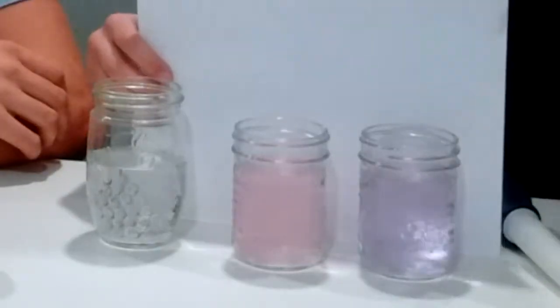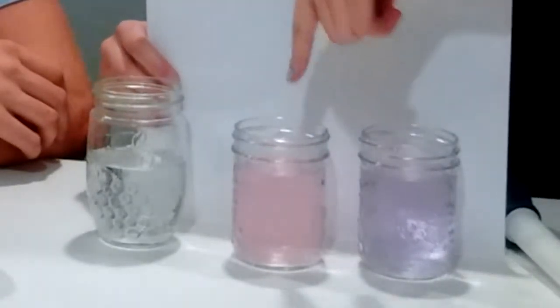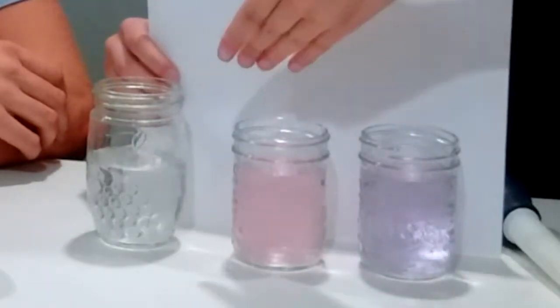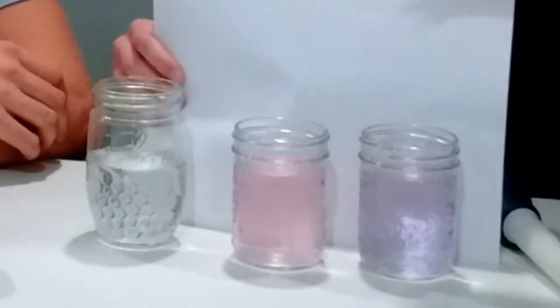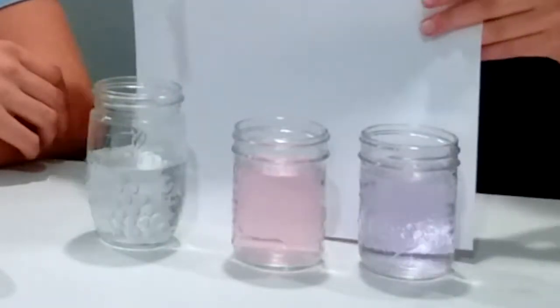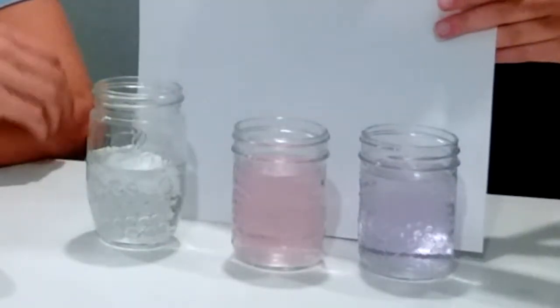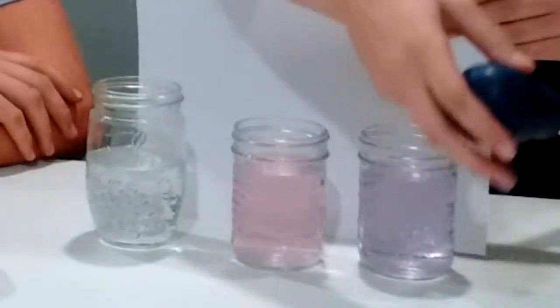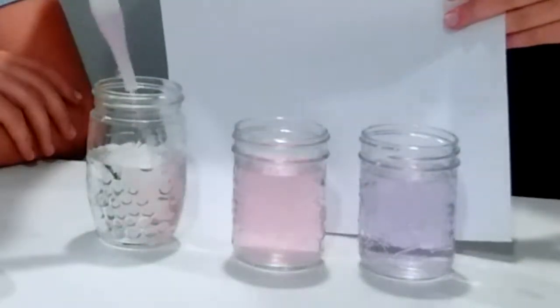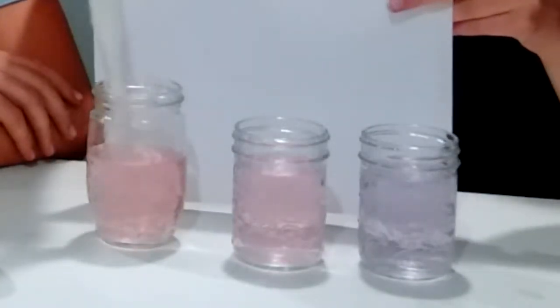So you can see this one's more purpley and that's more pink, and this is with the acid, so we would say this one got the infection. And of course that's because there is the exchange between these two. And then this is patient 0 here. So it should be at least as pink as the infected. Yes, we would hope. Yeah, and that's already quite pink.